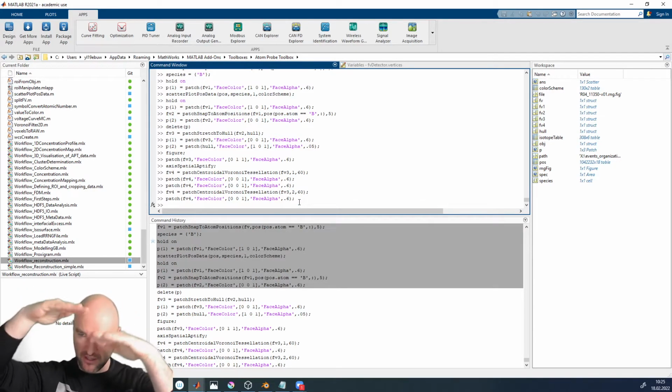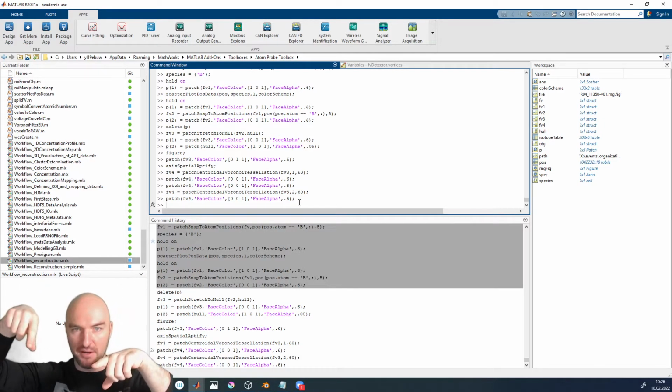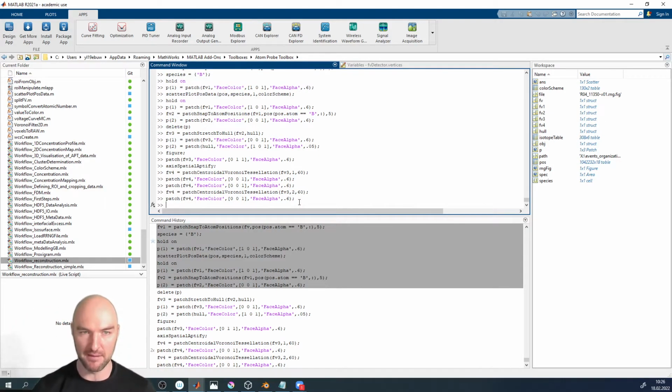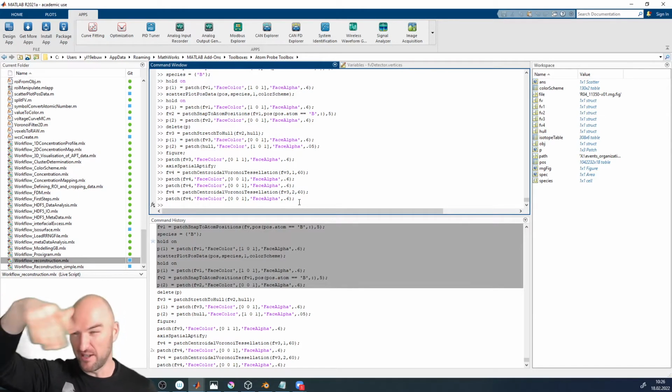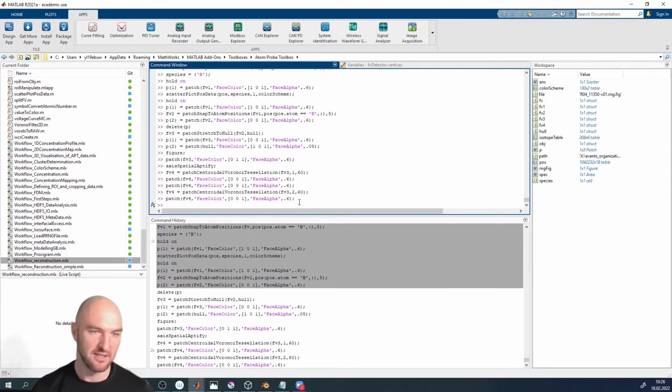These vertices are not necessarily moving where our atoms outline the grain boundary. So we might need to snap them back onto the dataset boundary, and back a little bit onto the atoms. And this is going to happen stronger the more curved your object is. If you've got a very, very curved object, you might need to resnap it. Now we have got a very flat object, so we are not going to need to do that very much.